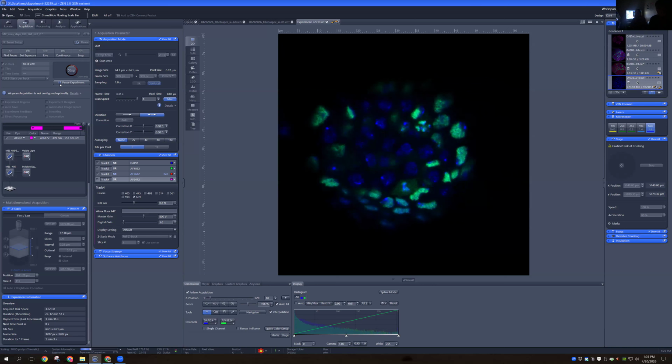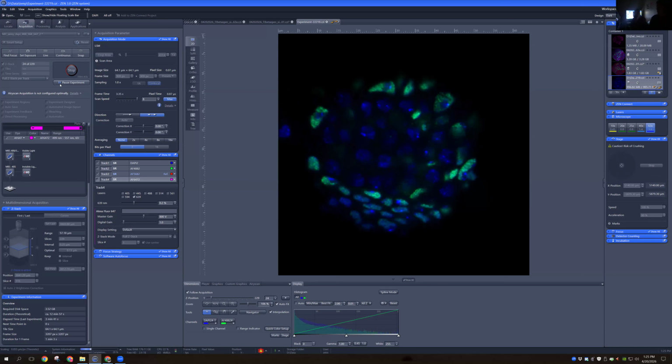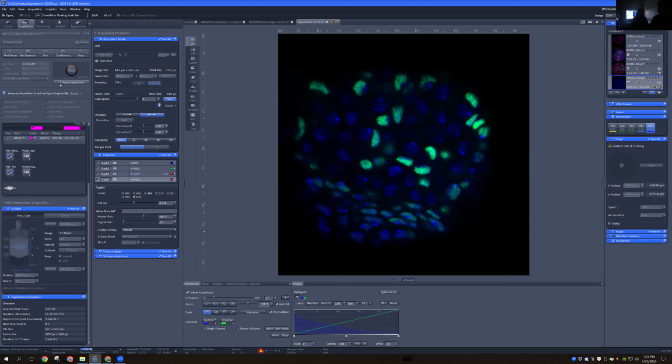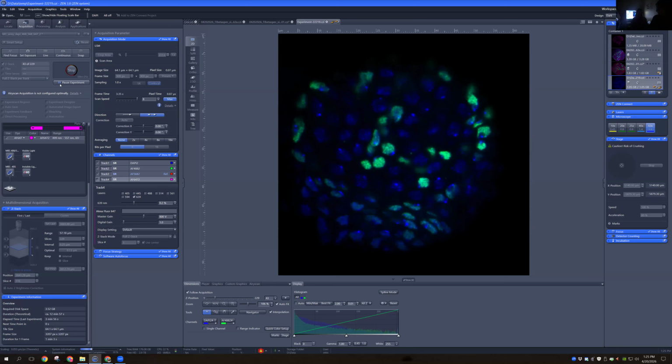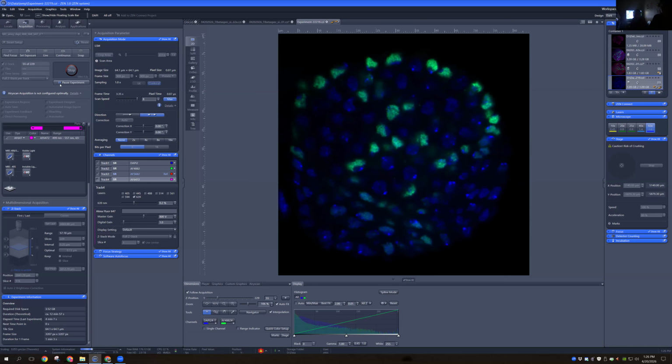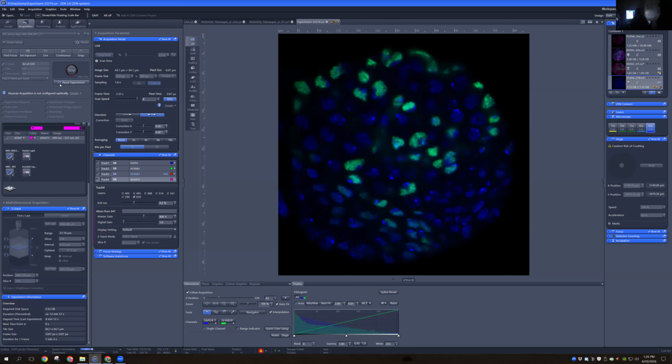And Michaela, you mentioned this earlier, but you said that these Z slices are very, very thin. So for the larval fly ovary, it is incredibly small. What is the distance range that you're imaging right now, from your first top Z stack to your last Z stack? So this one, they're all about 50 microns from top to bottom. So that is 50 times 10 to the negative 6 meters. Yep. And I don't know that that's a helpful number. I will convert it to a helpful number.